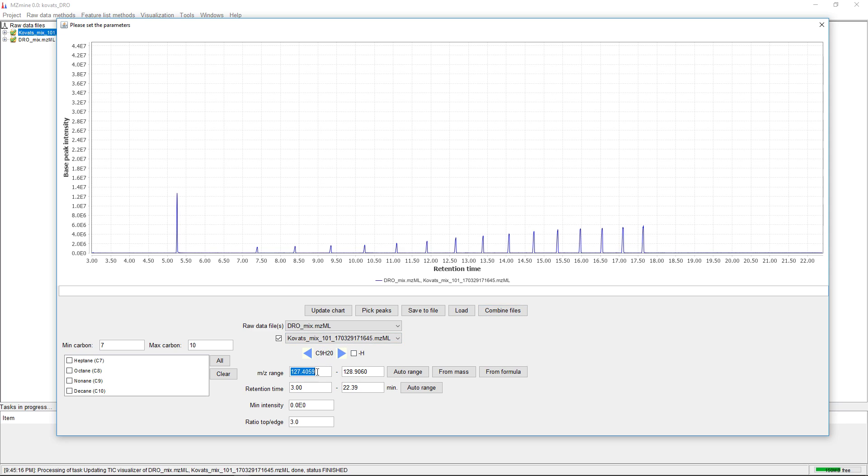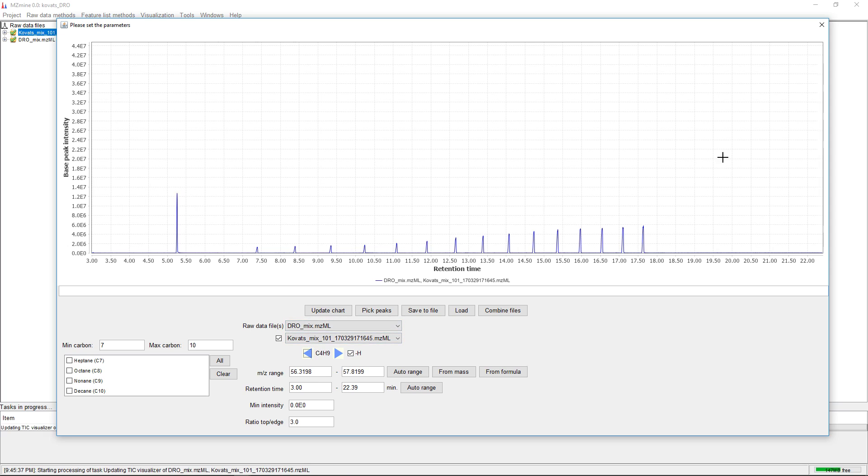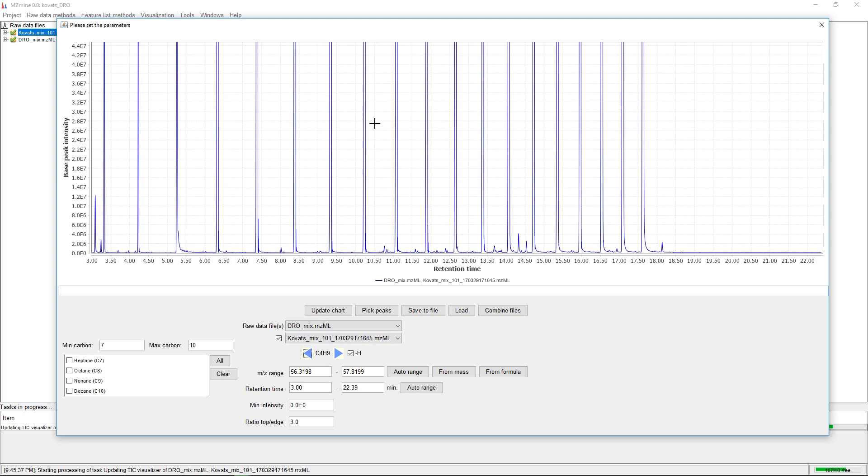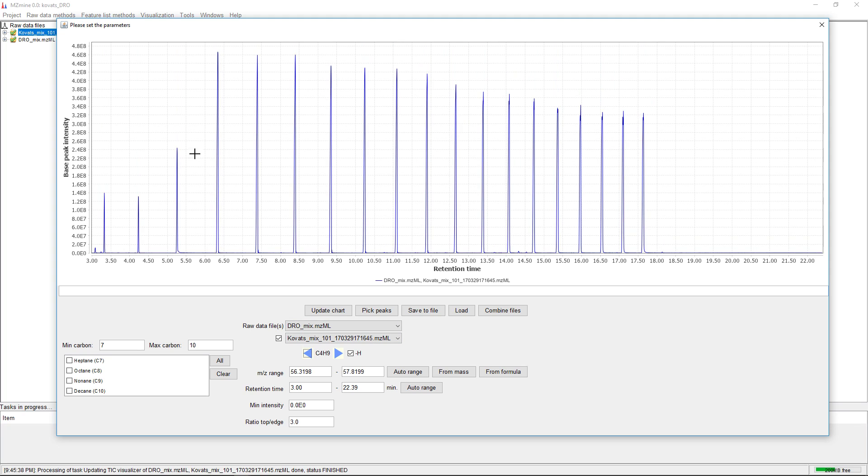They just have some signals in this range. First of all, it's very important to choose a base peak plot that's representative of our sample.